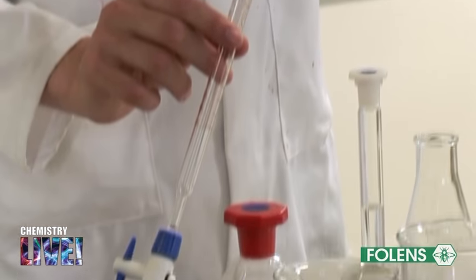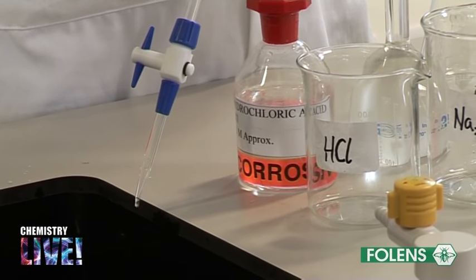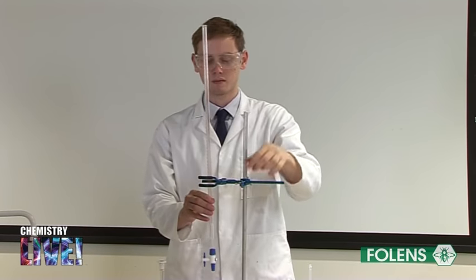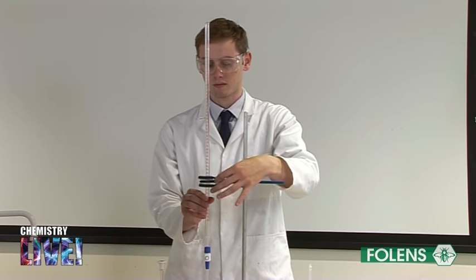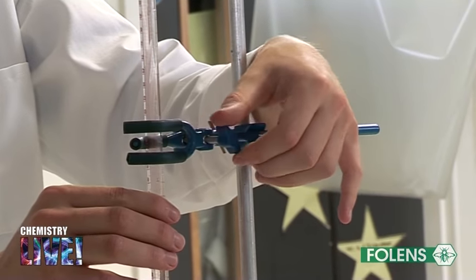Sodium hydroxide solution attacks glass, especially the ground surfaces in some burette taps. Also, it absorbs carbon dioxide from the air and forms a crust of sodium carbonate around the tap. This happens even with the modern plastic taps. Both of these actions cause burette taps to become seized up.